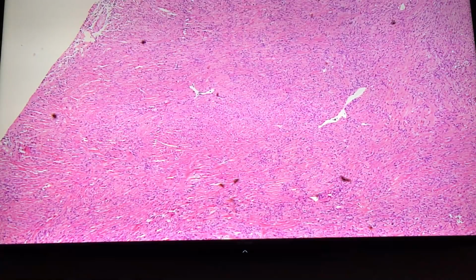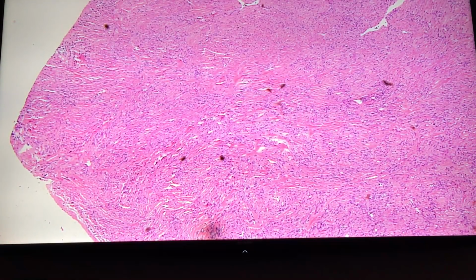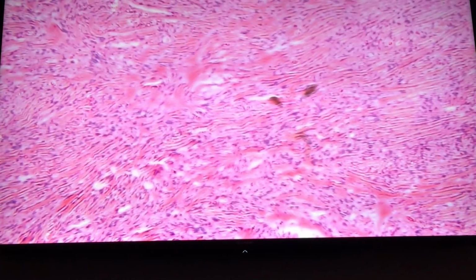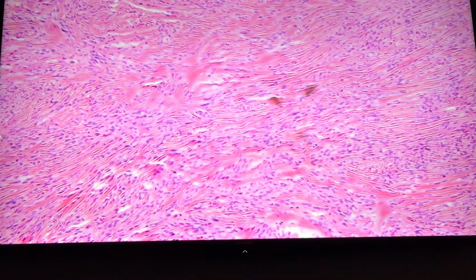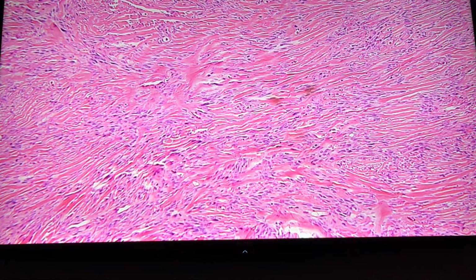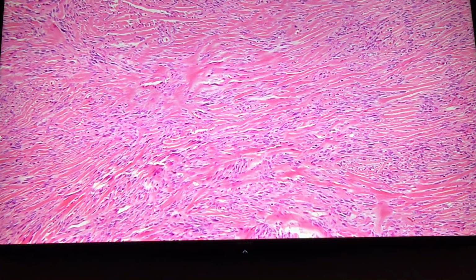There's something at low mag that you should recognize in there, and then go higher, Aaron, and leave it. Yes, yes. So Frido, tell them why you thought of that, and Aaron, flip in the condenser for a second and get the focus right. So why did you think of that?